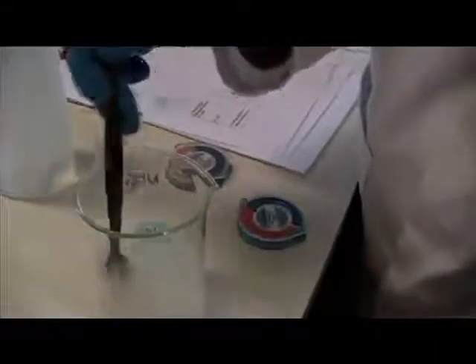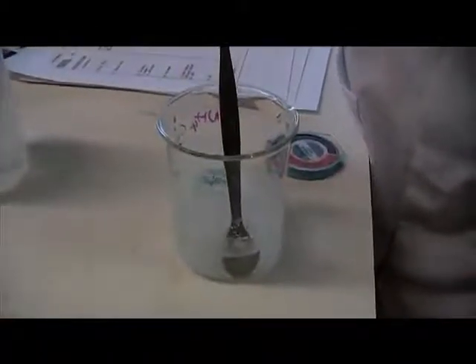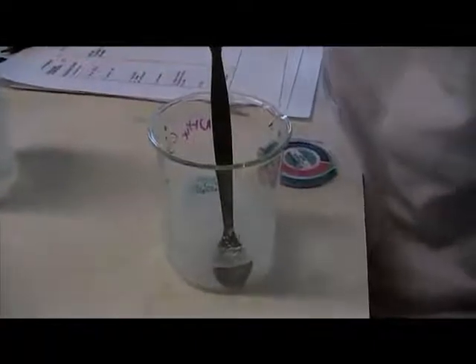Okay, so we have dissolved our unknown compound with some distilled water. And now we're going to test if it's an acid or an alkali with some litmus paper. I'm going to use blue litmus paper, so that'll show if it's an acid or an alkali. So it's clearly going red, so that is definitely an acid.